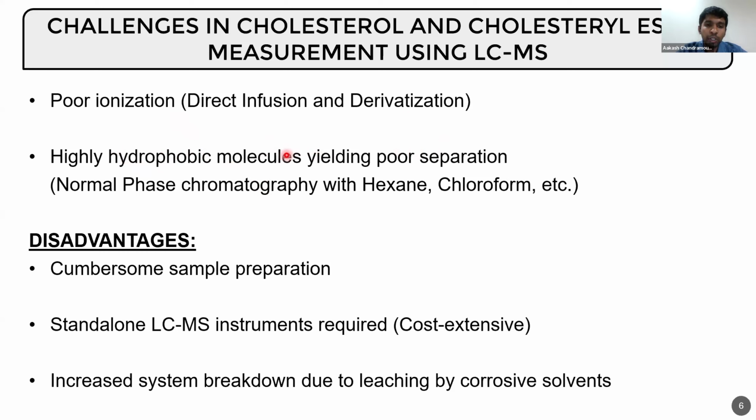However, since these molecules are also hydrophobic, they are very difficult to separate using normal reverse phase chromatography, which is usually used for general lipidomic protocols. Due to this, people have adapted normal phase chromatography with hexane or chloroform, and this generally yields a good separation, but there are certain disadvantages with these approaches, which are mentioned here.